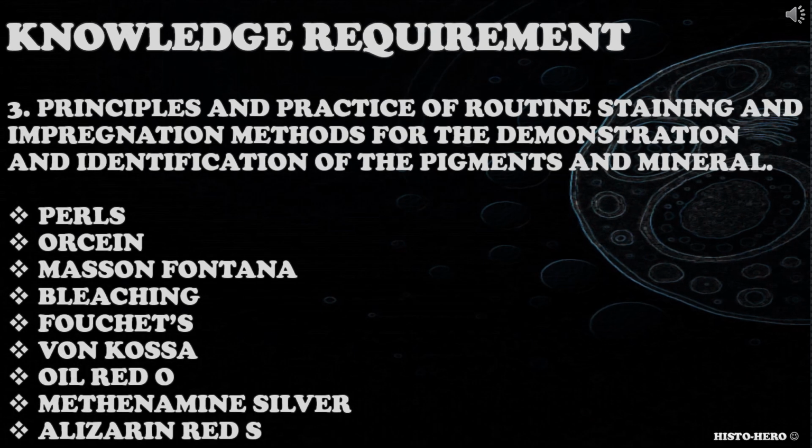The third knowledge requirement is for you to know the principles and practice of routine staining and impregnation methods for the demonstration of pigments and minerals. What demonstration methods would you use to detect pigments and minerals? Consider the stains highlighted in the indicative repertoire and stains used in your department, their principles and practice.